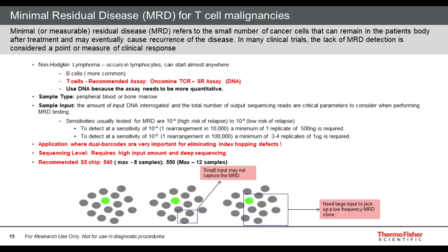When we released the short read assay earlier this year, we released it with support for the use of dual barcodes with the samples, and this avoids problems with barcode contamination, sometimes also called index hopping, which would be otherwise very detrimental to this kind of application.